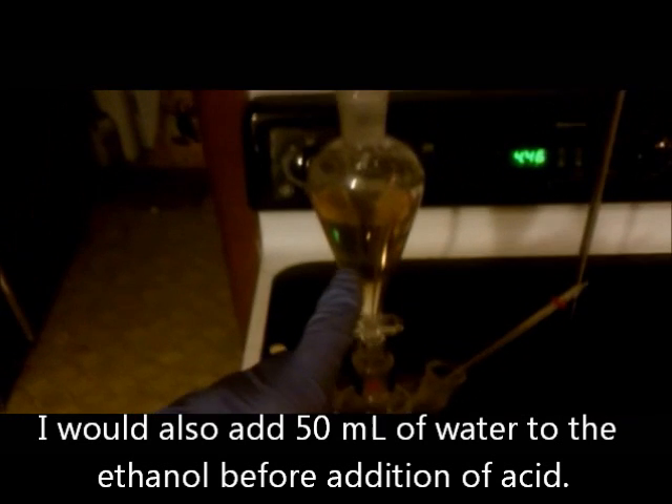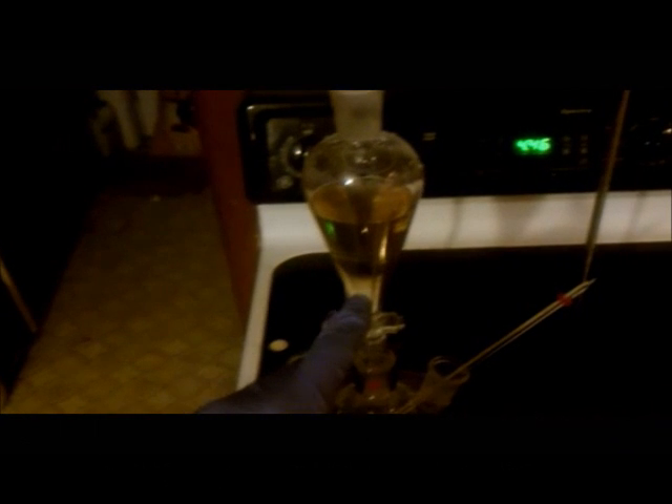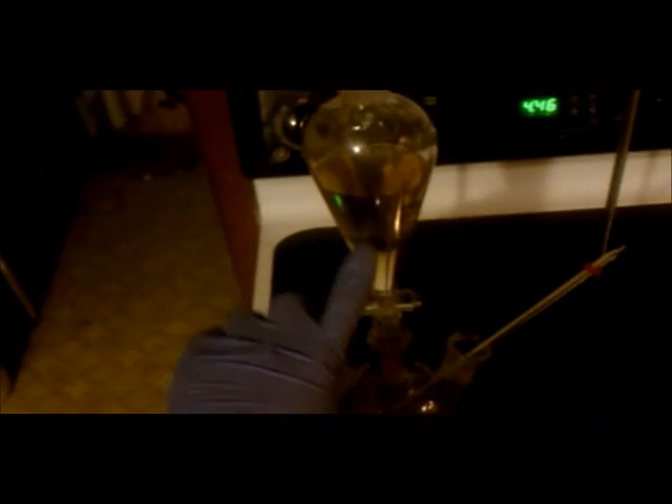This is the synthesis of bromoethane. I have here 126 milliliters of ethanol, and in the addition funnel I have 140 milliliters of concentrated sulfuric acid. This is on an ice bath and has been chilled down to a little below 5 degrees Celsius, and the acid has been chilled in the freezer as well. I'm going to add it slowly and not let the temperature of the alcohol get above 40 degrees Celsius.